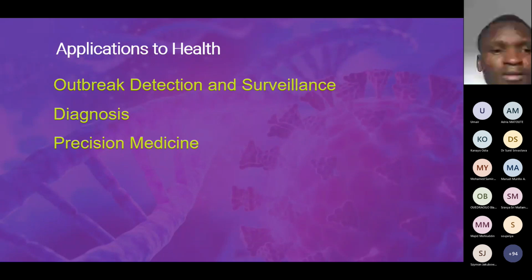But by studying the genetic makeup of the entire microbial community in a human, you could discover patterns you could narrow down and explore, in order to provide a specific, precise approach to deal with the infection that is affecting an individual.